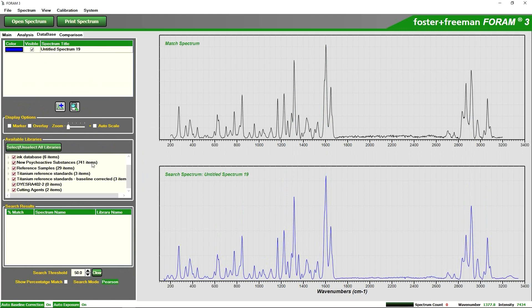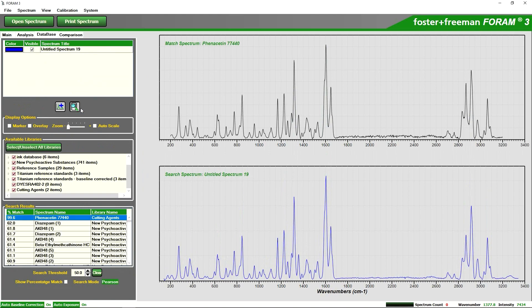I will search all of the databases for our particular sample. Click search and in this case we can see we have a 99.6% match with phenacetin.